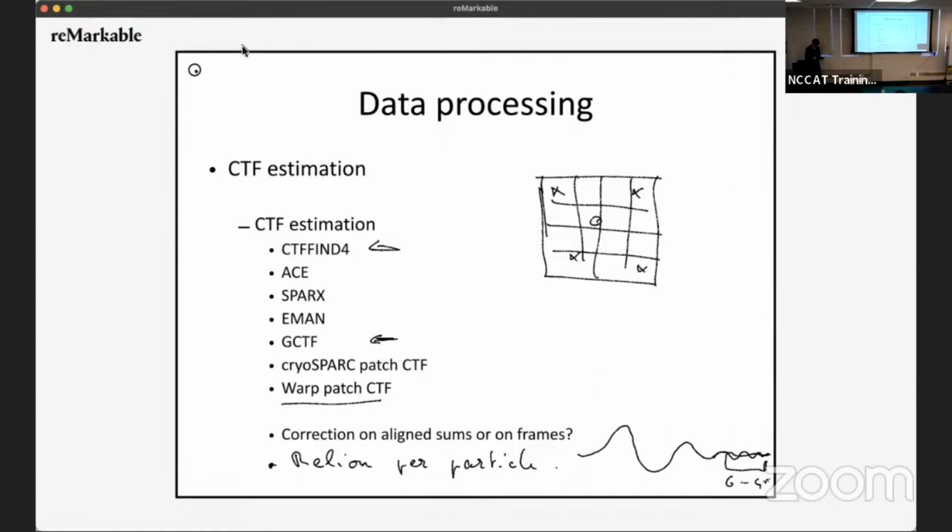So the thing to think about is, if you have a low defocus, you'll have very few oscillations, but very little contrast. So that's why we don't like it. And so here the question is, how low can I go until I can no longer align my particles? I think that's probably the experiment to do, which is to go as low as you can, probably with a different range of samples that have different features, and see at what point the alignment breaks down, so that we have a hard limit.